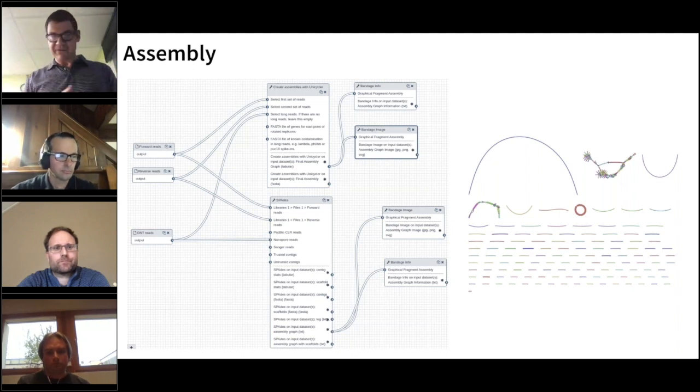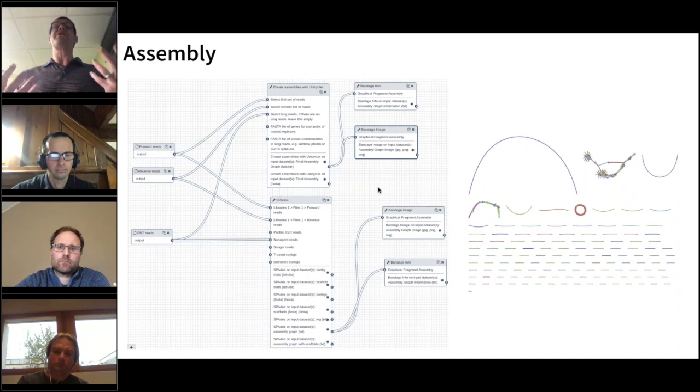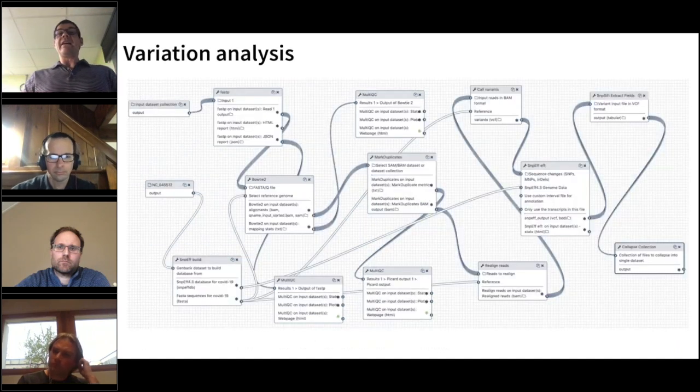So you're sequencing everything. There are human reads, obviously. There are reads coming from secondary infections, and there are SARS-CoV-2 reads as well. So the workflow we provide uses Unicycler. It's a SPAdes-based assembler, but there are other assemblers in Galaxy if you want to try something else. Although this particular workflow gives very good results.